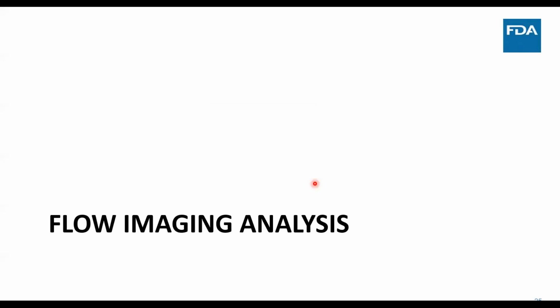Let's go to our next technique, flow imaging analysis. I think it's referred to in some quarters as dynamic flow analysis or dynamic flow imaging. USP uses flow imaging analysis, so that's what I'll stick to in the last part of our presentation.